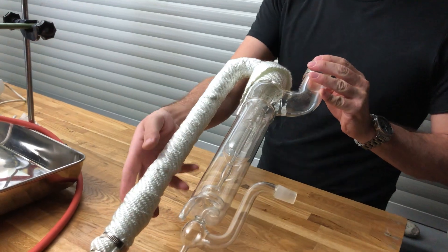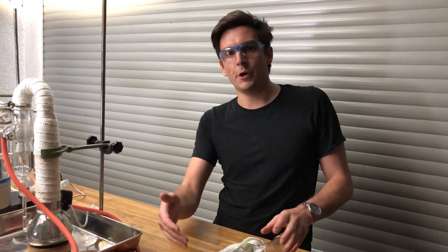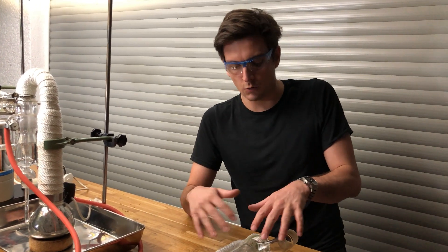That's basically how this type of pump works. It doesn't matter if it's an oil diffusion pump or a mercury diffusion pump, they work on the same principle. As I've said before, I've made a video on the topic and how these pumps work.